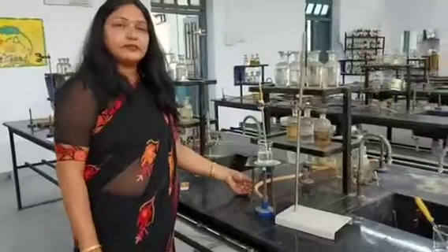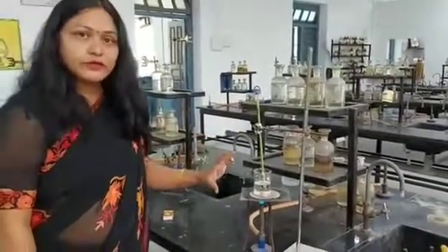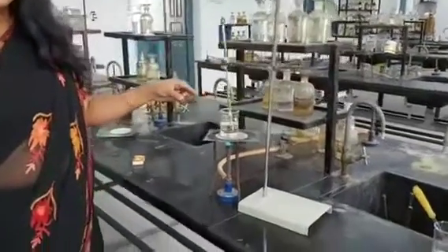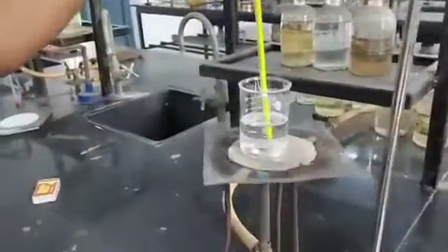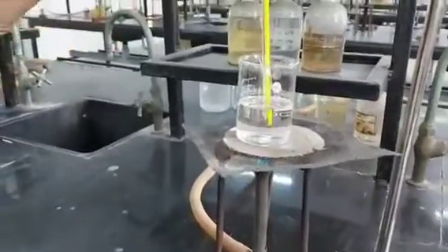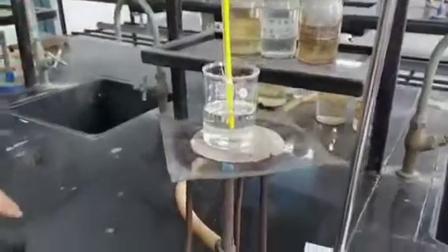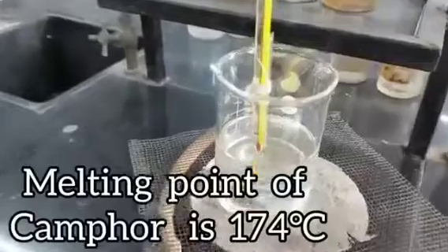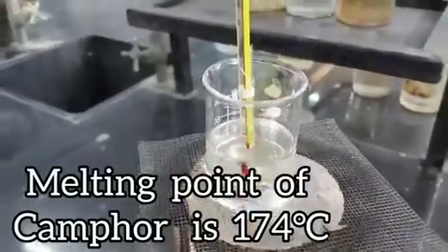Now the next part of this experiment is determination of melting point of first the pure solvent and then the mixture. So for this we have taken this melting point apparatus. Here we have tied the capillary tube containing the pure solvent, that is camphor, and we are determining the melting point of this pure solvent. The camphor has completely melted and the melting point of pure solvent comes out to be 174 degrees Celsius.